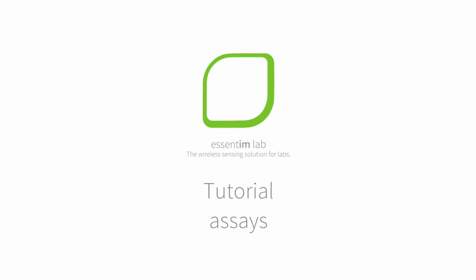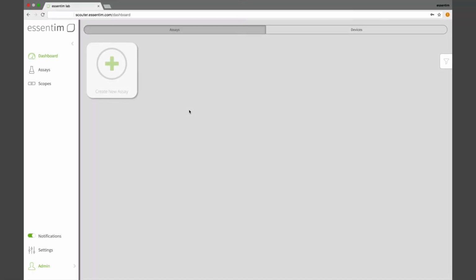Welcome to the essentim tutorial video Assays. An assay is the key element of our app. Assays are used to summarize all the information of an experiment using scopes as data source for sensor parameters like temperature and humidity, as well as manual information you can enter in the Assays view window.